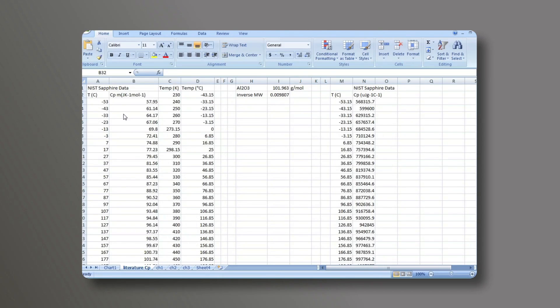Then I need to go through several unit changes to eventually get to a heat capacity in the unit of microjoules per gram degree C. In order to do these unit changes, the molecular weight of the material needs to be known.